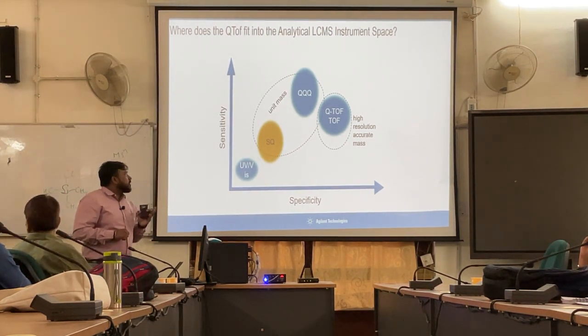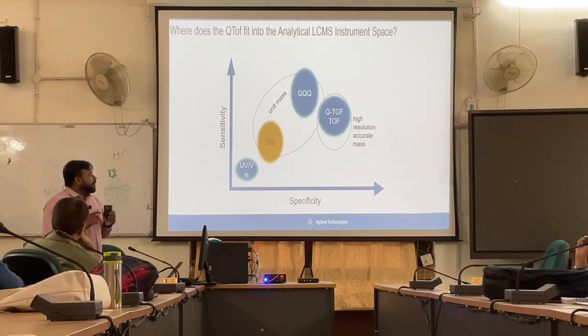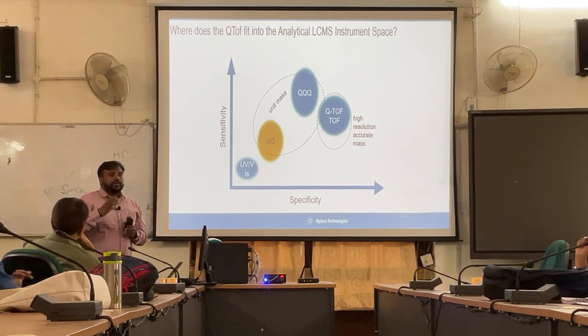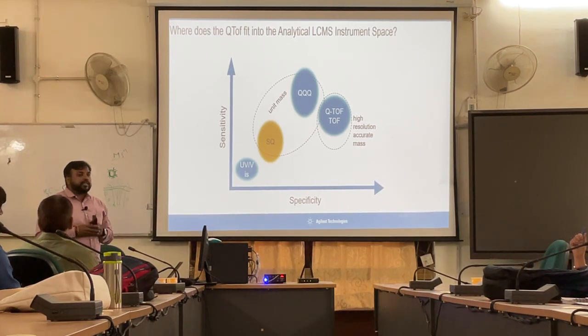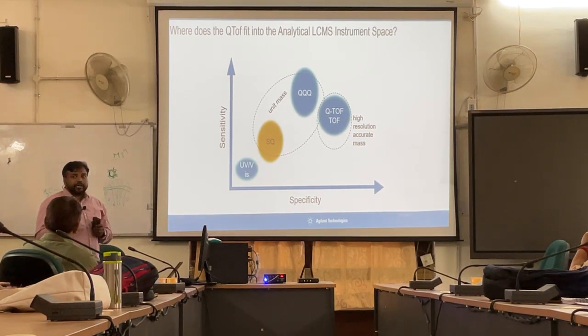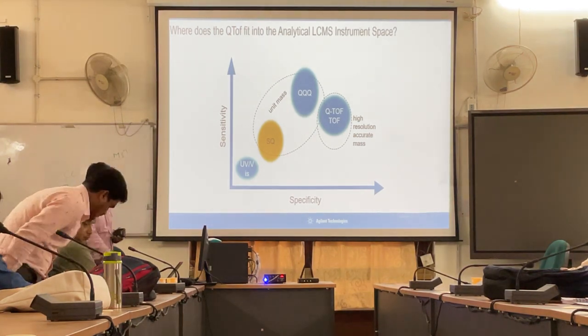But these two technologies of mass spectrometry, single quadrupole and triple quadrupole, are unit mass resolution based. Meaning, if we do not have accurate masses to the third and fourth decimal digit, the monoisotopic confirmation would not be that accurate, but it is actually required to confirm the molecule. So to get the molecule in a more accurate way, we need HRMS as a technology to do discovery kind of analysis and non-targeted metabolite identification on the basis of their monoisotopic pattern.